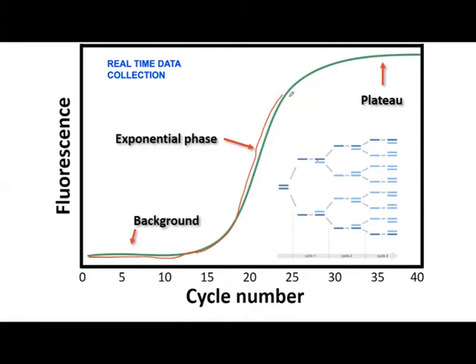And then after, when you have too much fluorescence, because after like 25 cycles here, the tube will fluoresce like a green color. For example, if you're measuring green light, it will be too green that the machine cannot tell the difference. So that's why you're going to get a plateau. So that's why in a PCR, you're going to get a sigmoidal curve like this. The beginning of the curve is because the camera is not sensitive to the difference in fluorescence, and the end of the curve is because of the fluorescence saturation.